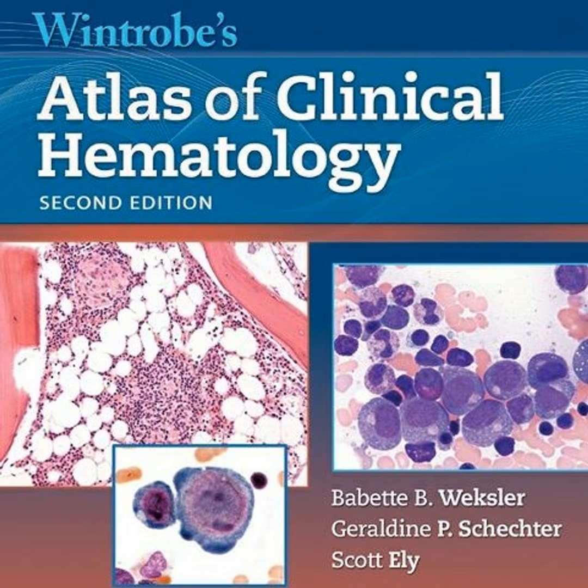The diagnosis of amyloid has to start with morphology. You need to see those dark red deposits on a Congo red stain, and then confirm it with polarized light. Right. You have to see that pathognomonic apple-green birefringence under polarized light. That confirms you have amyloid. The misfolded protein is there.